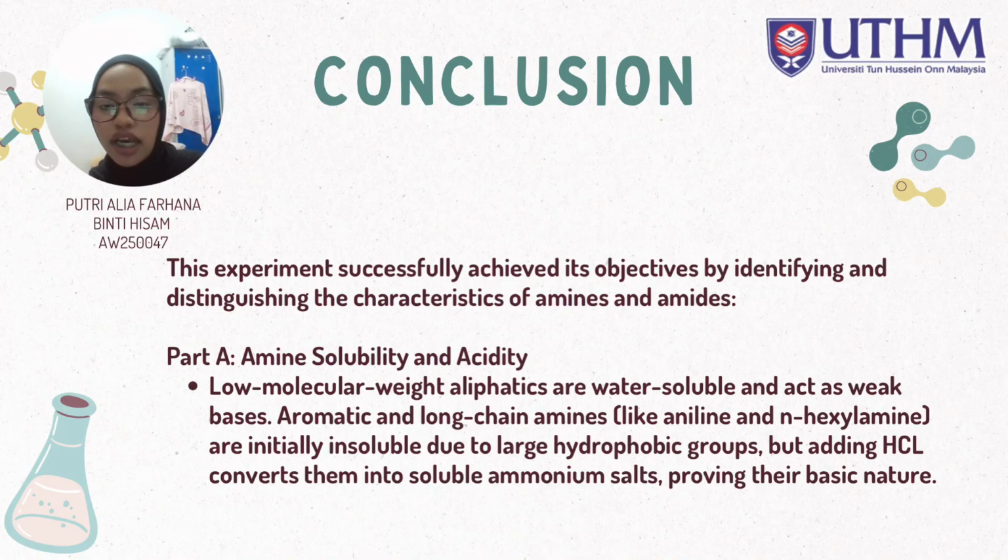For part A, amine solubility and acidity. Low molecular weight aliphatics are water soluble and act as weak bases. Aromatic and long-chain amines like aniline and N-hexylamine are initially insoluble due to large hydrophobic groups. Adding HCl converts them into soluble ammonium salts, proving their basic nature.